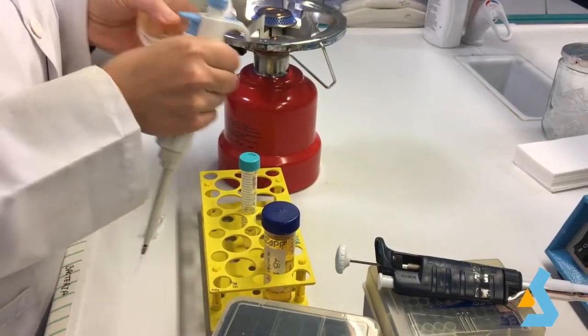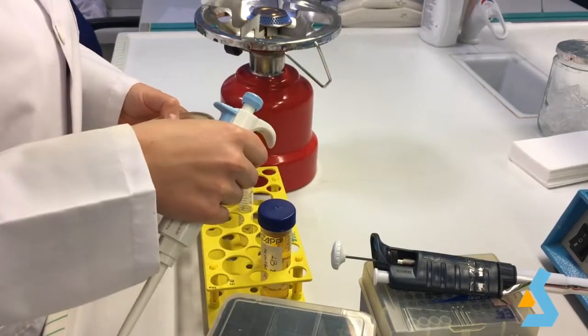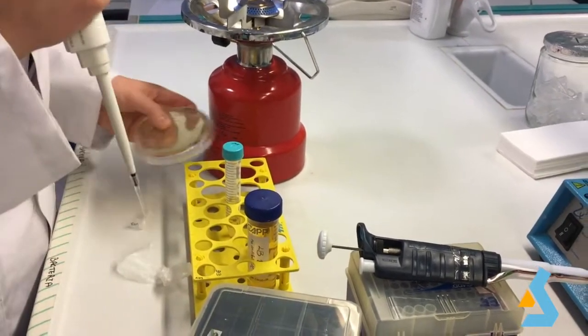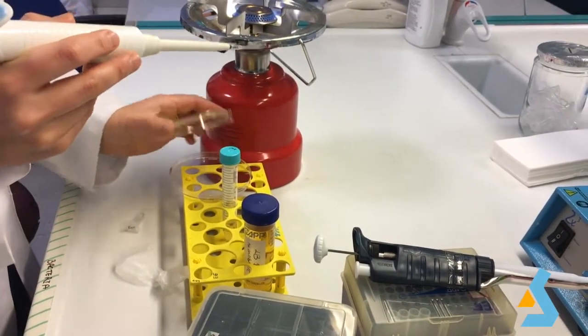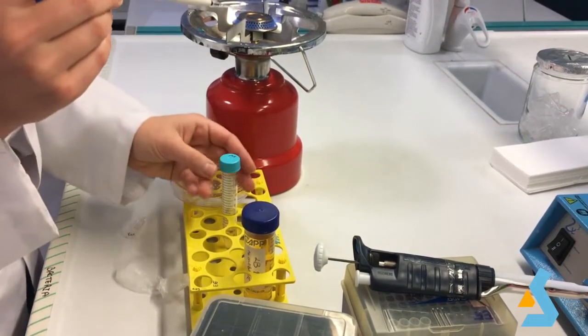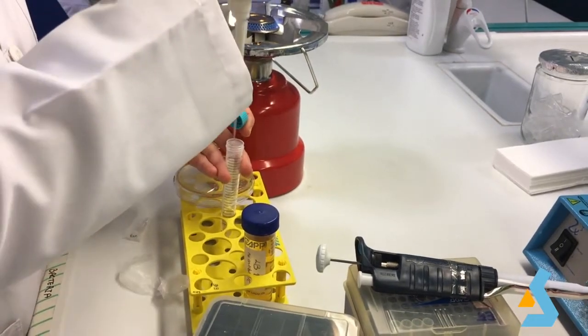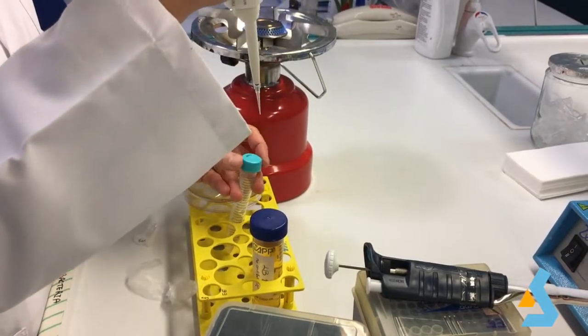After that, we remove the parafilm on the plate and select one colony and then inoculate in the LB kanamycin medium. We left the bacterial culture to grow overnight in the 37 degrees Celsius shaken incubator. Do not extend the time more than 16 hours, otherwise the antibiotic amount in the media may deplete.